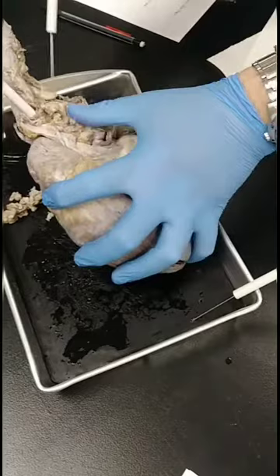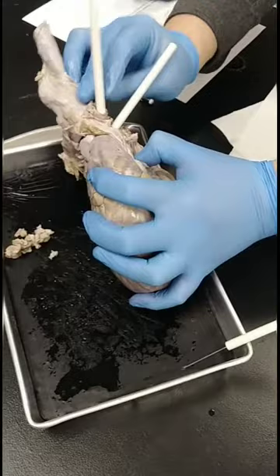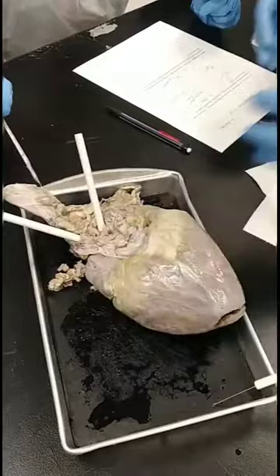Make sense? So you have a vein. This is much thinner than the artery. See how thin it is? This is the big aorta up here. Look at that thickness compared to this thickness. See that? Okay, take a look at step two. It's asking about the vena cava, right?